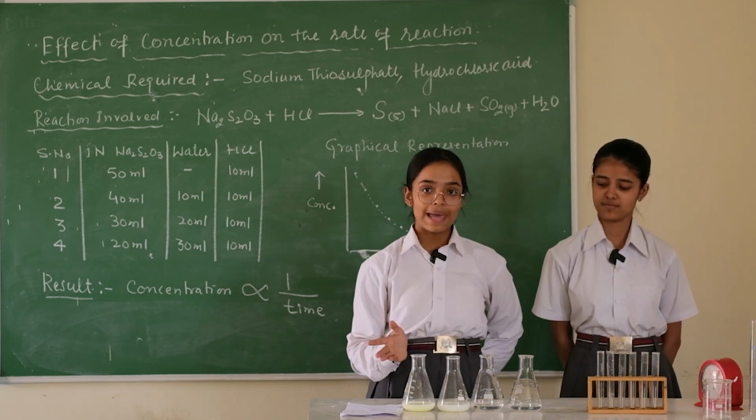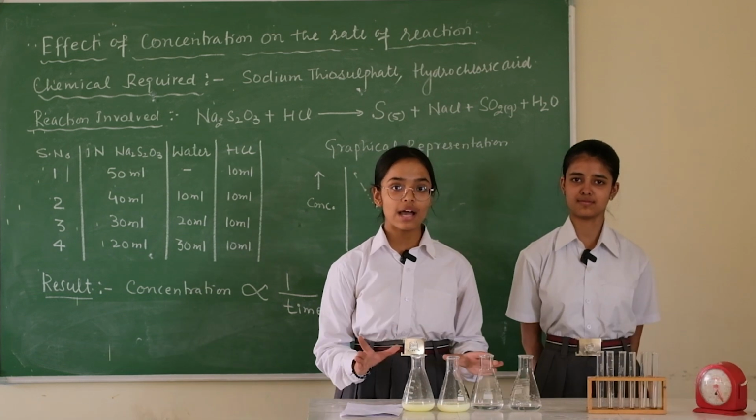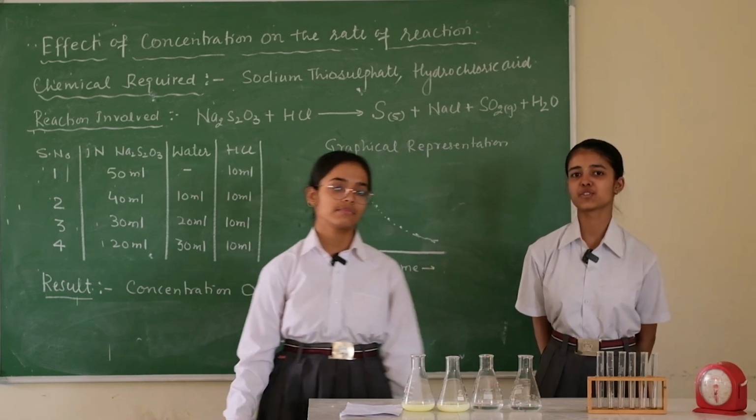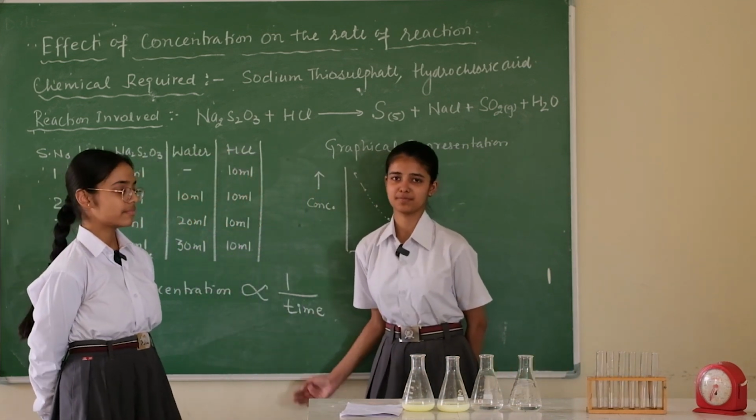We will repeat the same activity with third and fourth conical flask, and we will find that on decreasing the concentration, the time taken to complete the reaction increases. So we can say that concentration is inversely proportional to time.